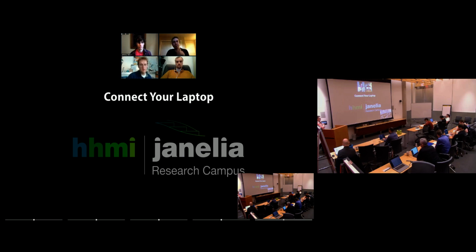So this is not fancy in terms of microscopy, and really more of what my work is trying to do is get a system that has been described at the Nature Methods level into something that works in a pipeline environment, where we have multiple rigs deployed, running all the same software, with high uptime, and things don't break.